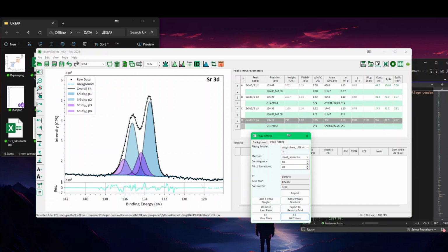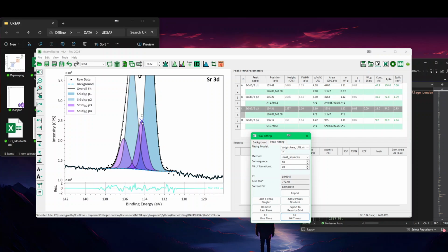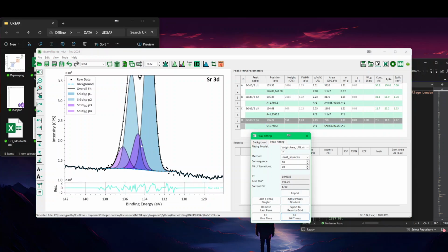When I fit it, when I get something like this, if I'm not happy, I will just check what I get, and I'm saying, no, actually, I would like it to be slightly smaller and slightly shifted. I would like it to be here. All I have to do is for the peak CD model to make this one in function of A. And I simply type A, and it will take the split of 1.23. And now I can refit it, and that's it.